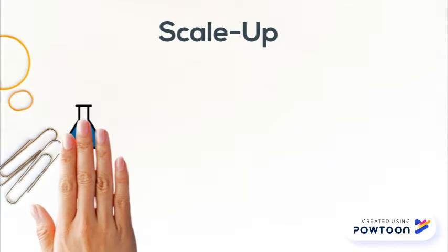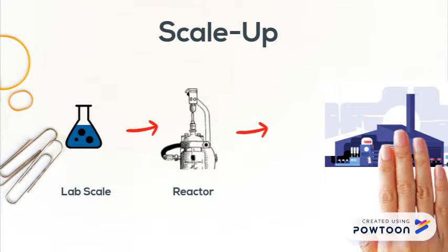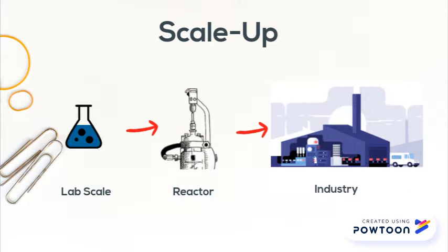In this part of the video, critical limitations associated with the design and scale-up of high-density cultures of mammalian cell bioprocessing will be discussed, along with the solutions to the associated problems.